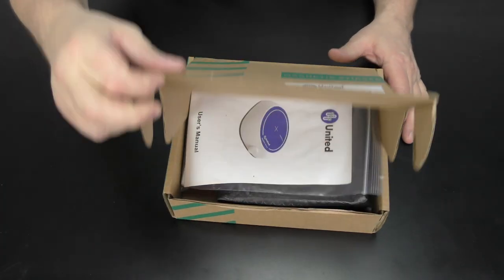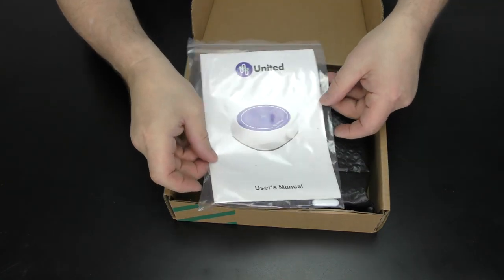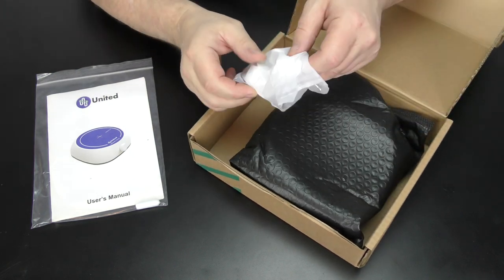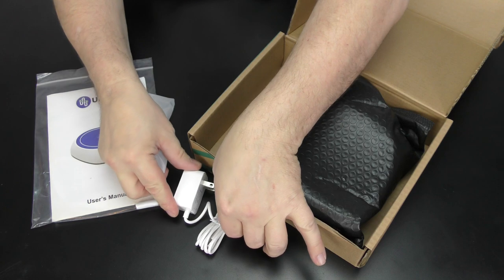If you need to stir a solution, you need something powerful but takes up very little space. This small but useful stirrer can handle beakers up to 2 liters in size and stir up to 1800 RPMs.